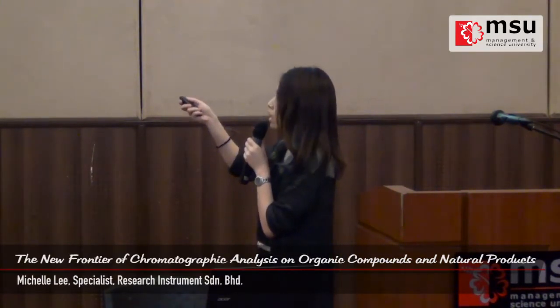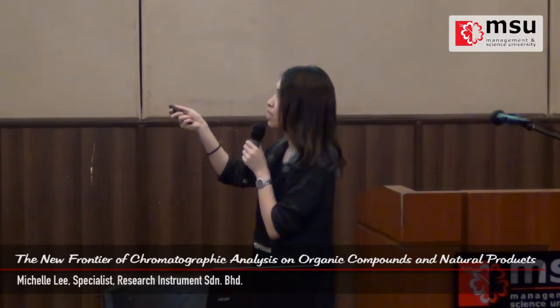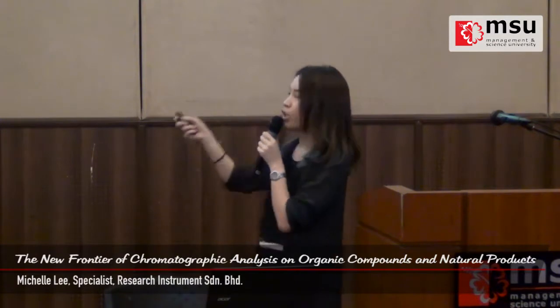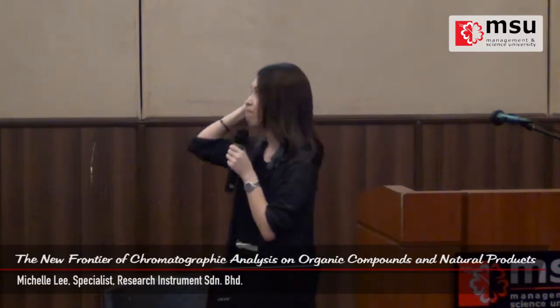So, thin layer chromatography, of course, has visualization, and it's a very rapid technique. The reason is that in one plate, you can spot maybe up to 12 to 15 samples, and with one development, you can have the results for all. But if you compare to other techniques like HPLC, it's injection by injection. So one injection, one sample, might already take you 20 minutes. Okay, so this is a much more rapid technique, and lower cost is mainly because of the lower solvent consumption.